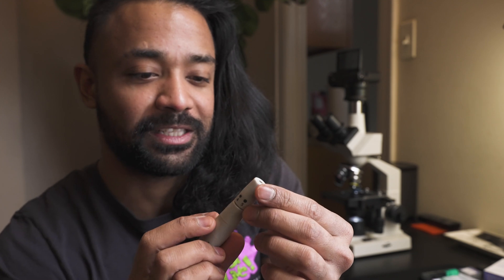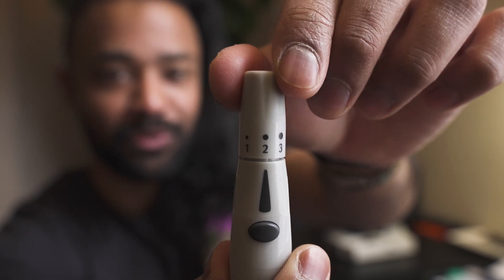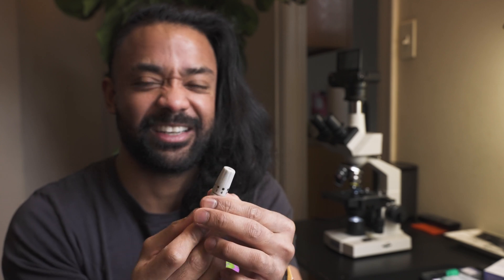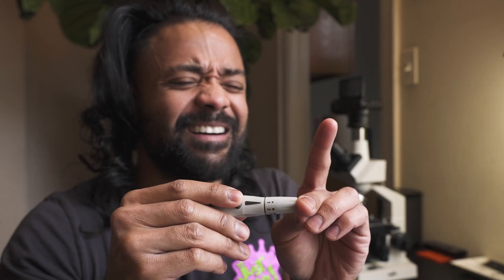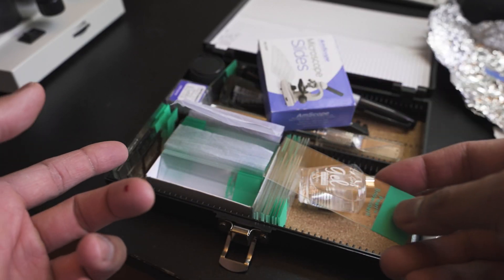I'm gonna put the cap on. You can actually select how much you want to bleed - I'm guessing one is the lowest, that's how much blood is gonna come out. Numbers two, three, four, and five. I hate this part. Oh my god, guys, this is the worst. I'm actually bleeding - look at that!